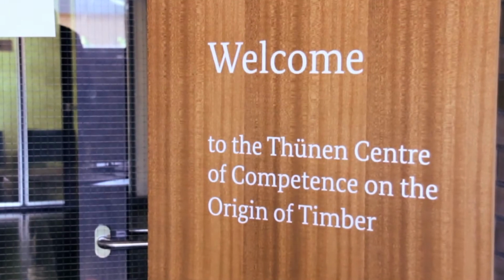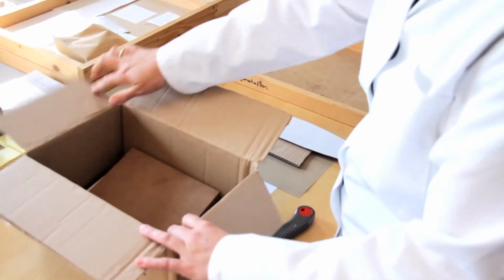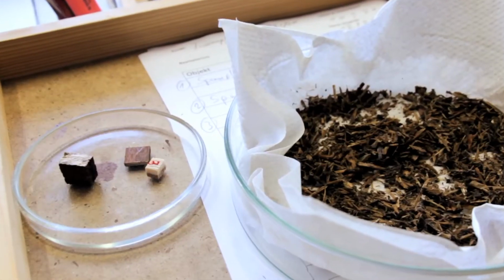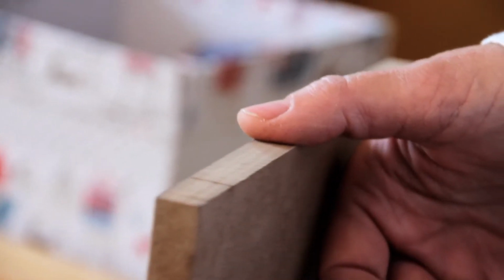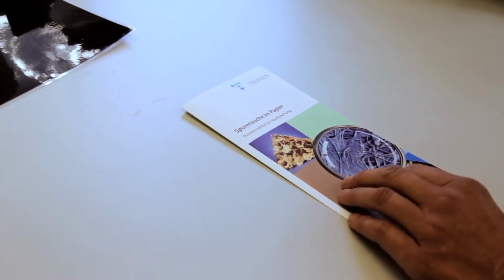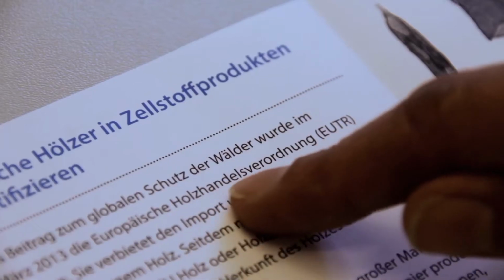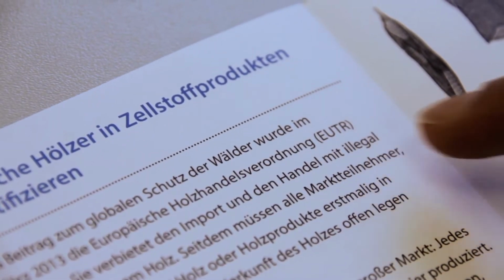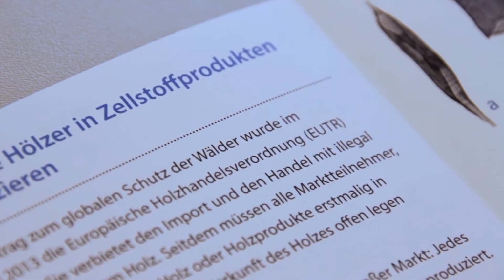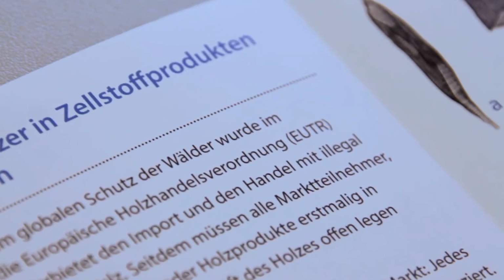Every day, several consignments arrive at the Thünen Center of Competence on the Origin of Timber for the identification of processed woods. These include solid wood and wood-based materials as well as pulp and paper products. The controls of the content of the processed wood serve the implementation of the EU Timber Regulation, the protection of endangered species, and consumer protection. The expertise is in demand by government agencies, the timber trade, consumers, and associations.